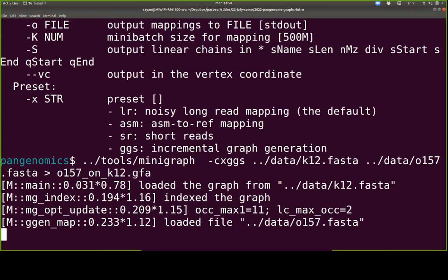Maybe because of the -c command, the new -c command. I remember running it with -c, it wasn't so long, it wasn't on this computer.